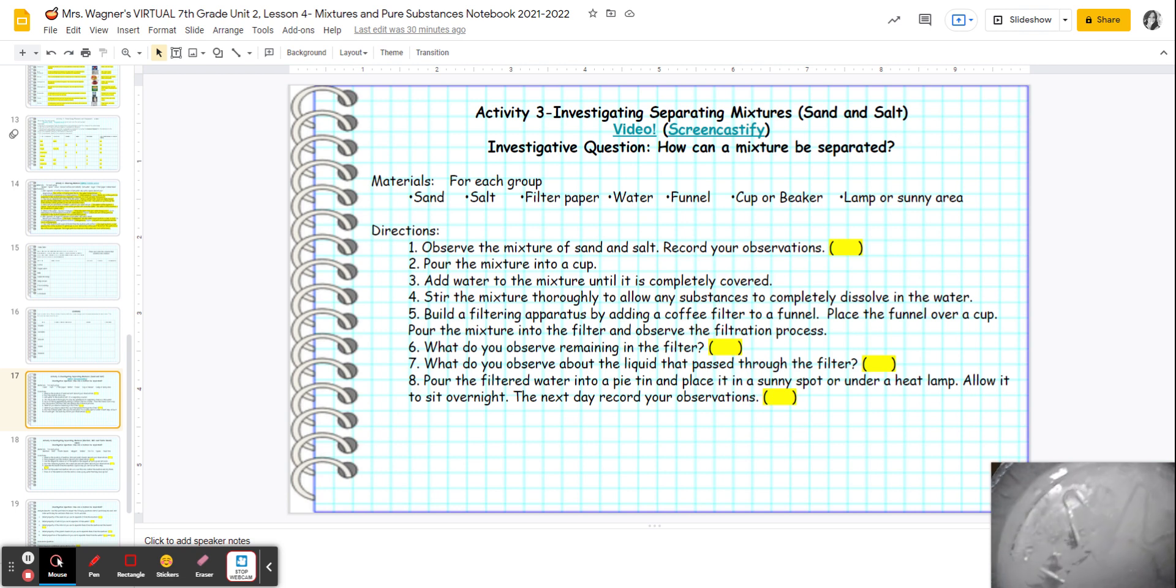And what we have left is the salt. Okay, and I don't even see the sand, right? That sand was all filtered out. And this literally is just the salt left.